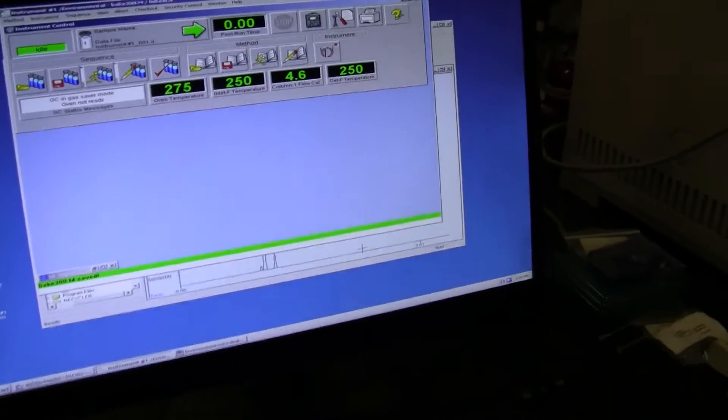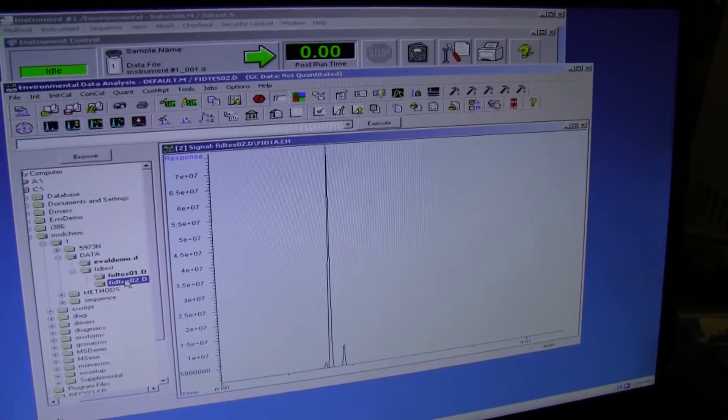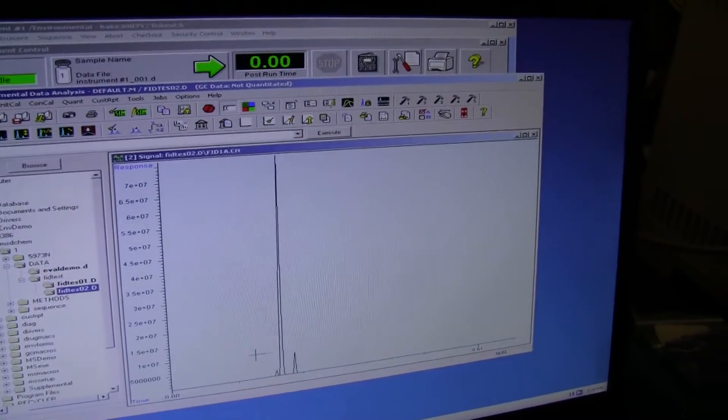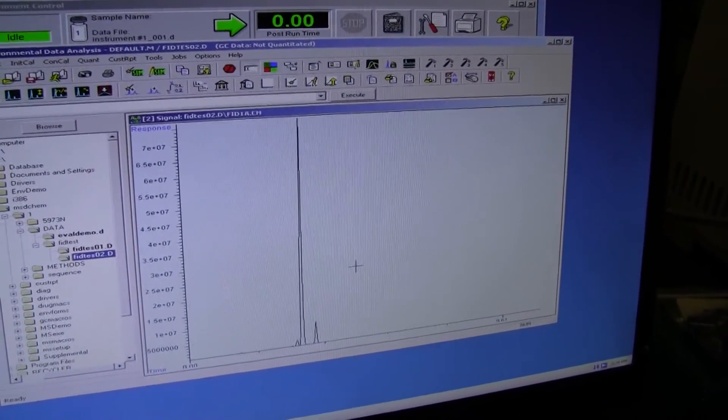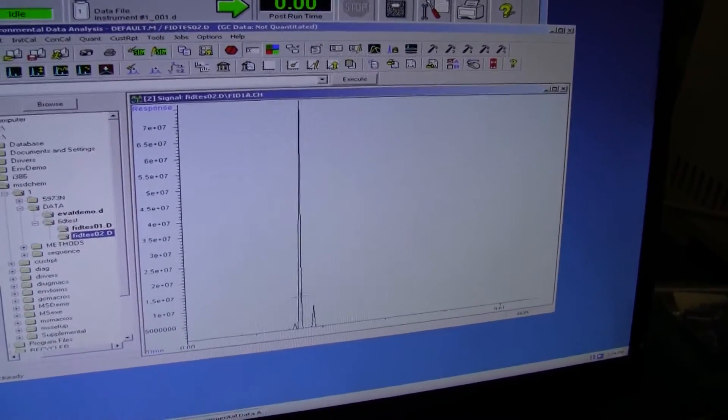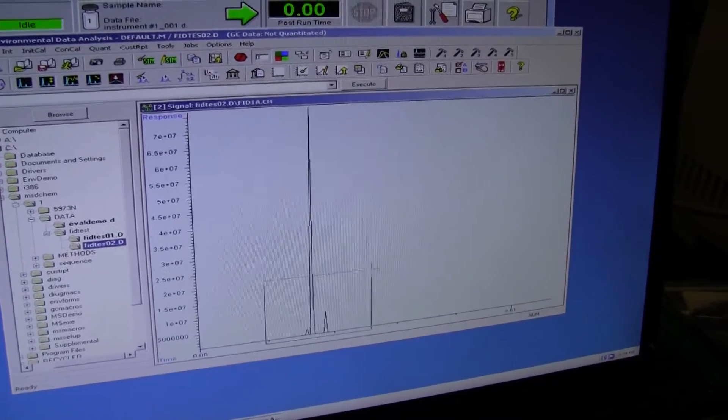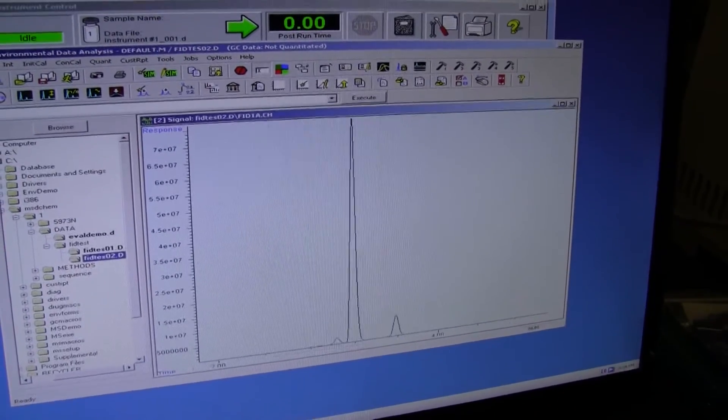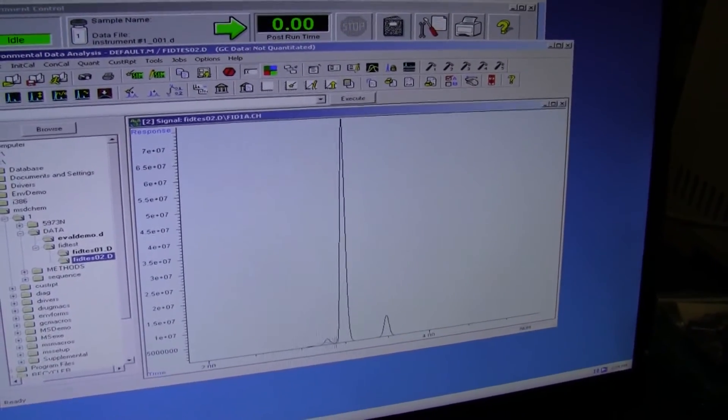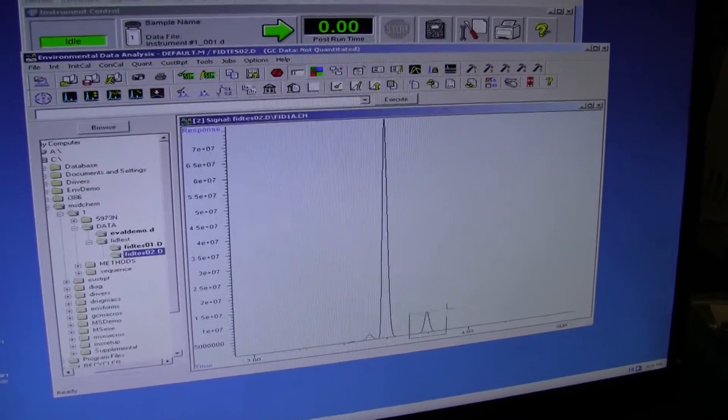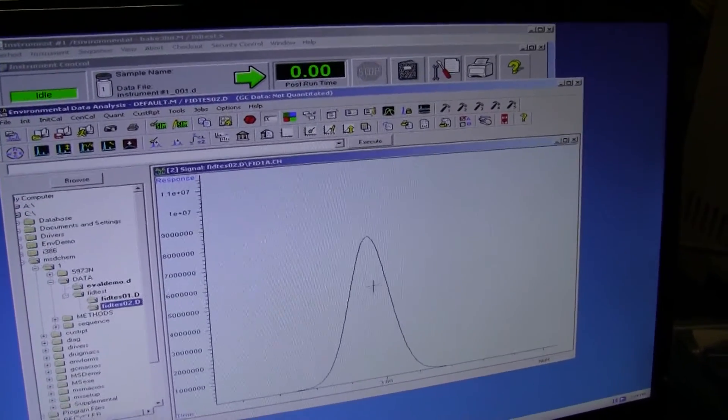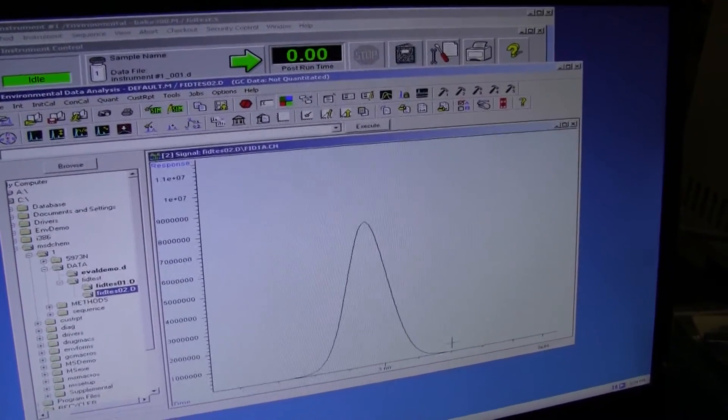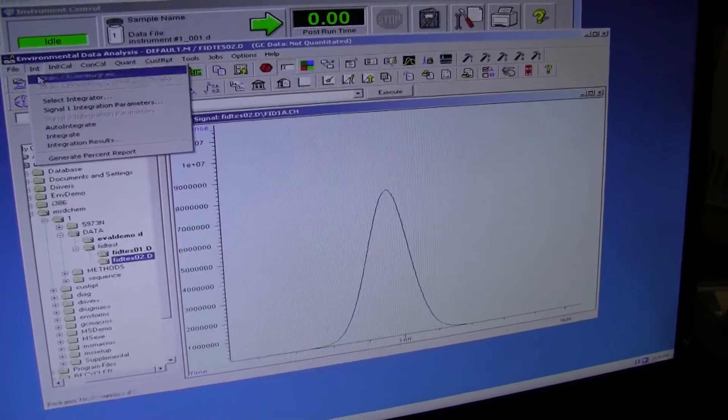After our 11 minutes, the run was completed, and here presenting, we clicked the standard. The expected peaks are what we expected to see. This certainly demonstrates the ease of use for the ChemStation software.